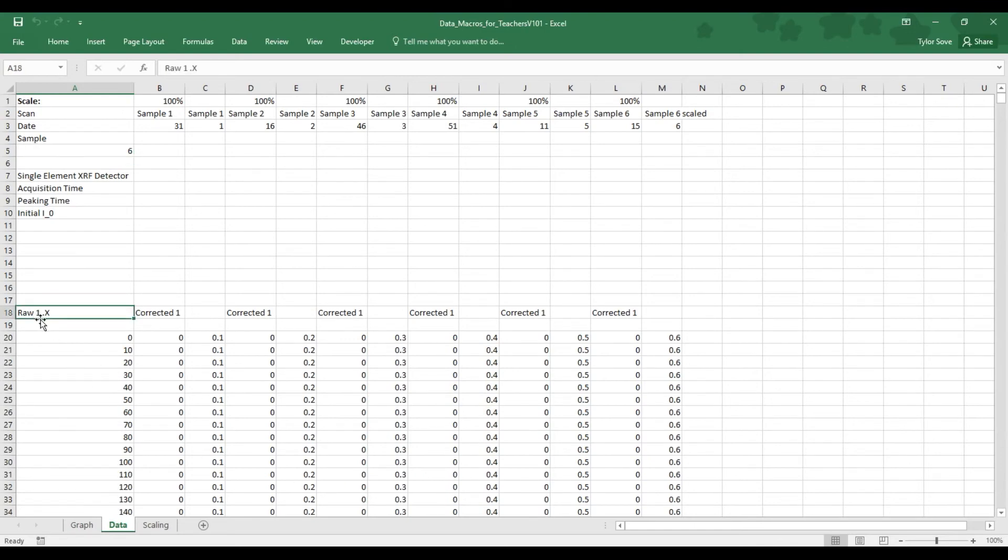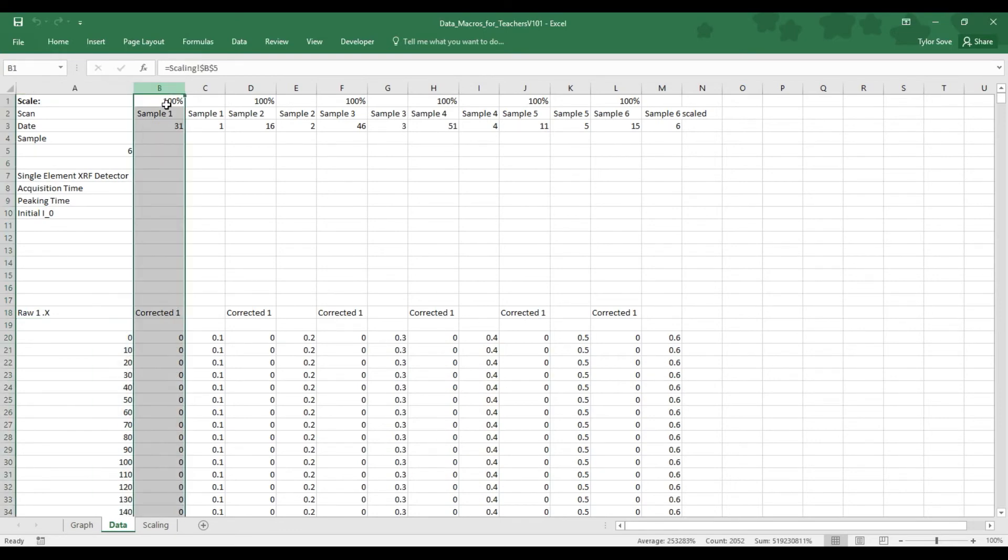This raw 1x and everything below it is the energy of our graph. If we start at column B, though, we can see that our sample names right here, the scale factor is 100%, and this will change depending what scale factor we have in the actual graph on the Scaling tab down here.